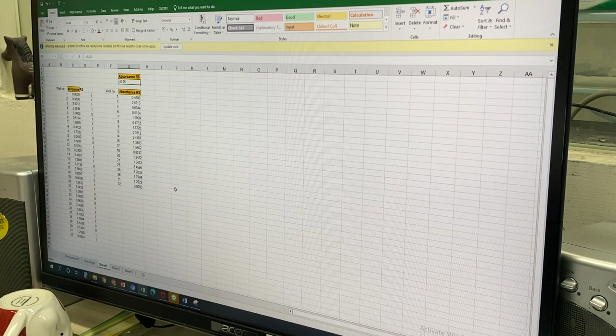Bacteria try to eat that carbon source and use it. After eating this carbon substrate, bacteria release the hydrogens.